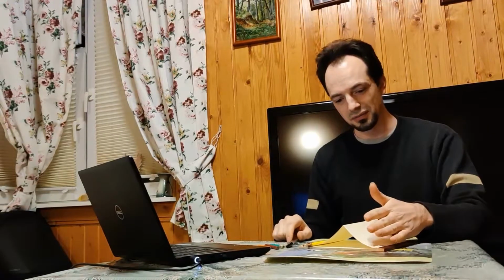The question is, will this image reflect in some way the surface relief of the sample? And I'm almost sure that you already have the answer. Yes, it will, because it looks like a ridge. This image would look like a ridge. The left part would be black or gray, the right part would be white or light gray. And it would resemble the object that we were scanning. So by the end of the scanning process, we end up with an image that surely resembles the sample surface.